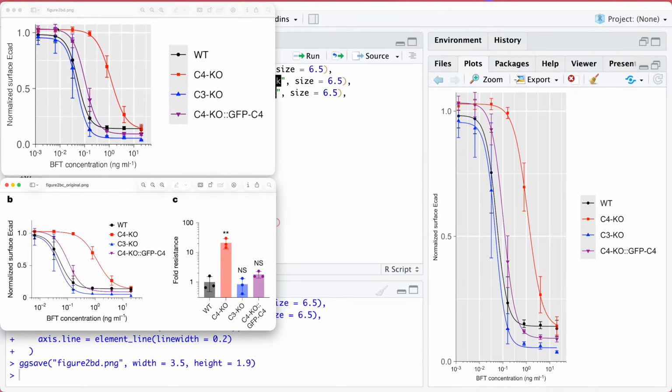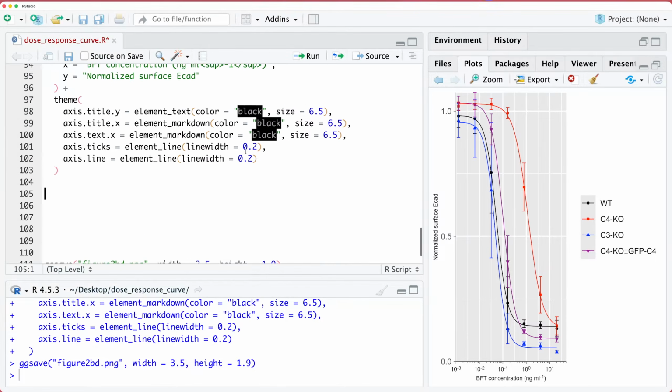And so now it's subtle, but we can now see those top error bars. Again, this error bar here, or this set of points here, is this here, okay?